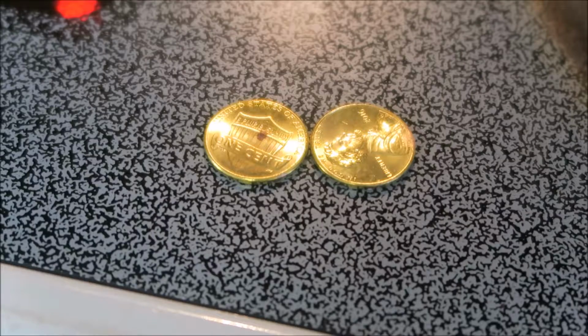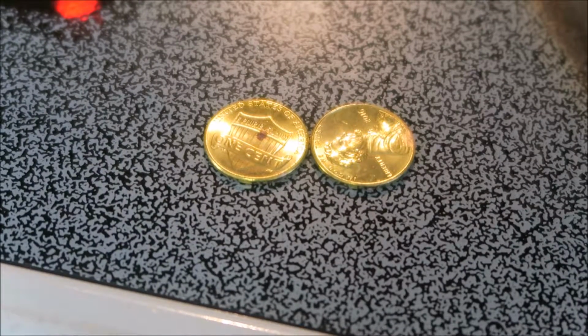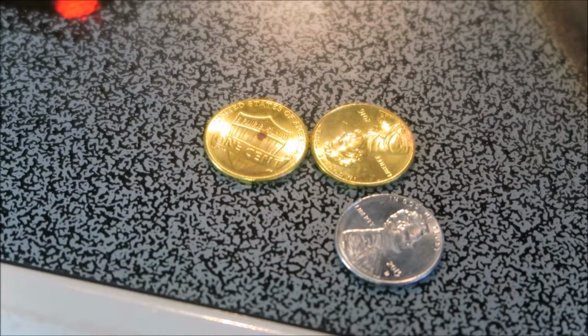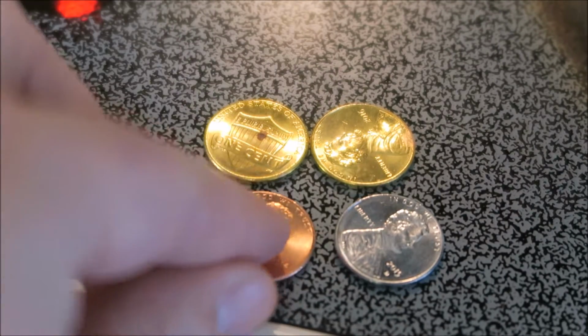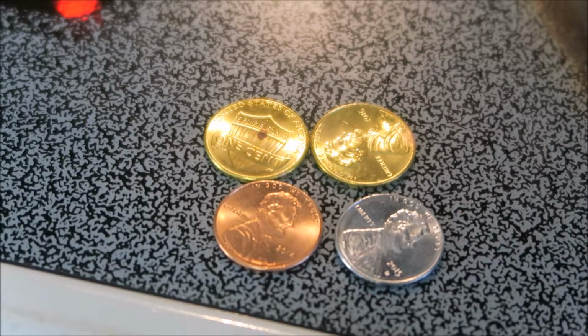And as you can see, after only about 30 seconds on the heat, they've got a nice yellowish gold color to them. You can especially see it in contrast to the silver color that they were before they went on the heat, and the copper color that they were before we started the whole process. Now imagine if you did this sort of thing in front of an audience hundreds of years ago. You probably would have been burned at the stake for witchcraft.